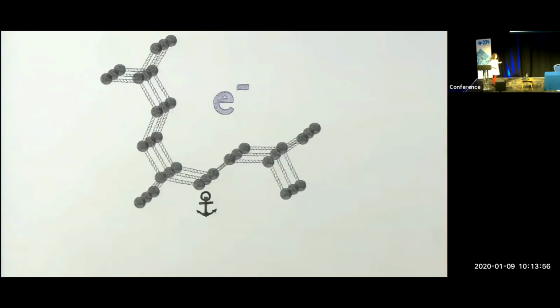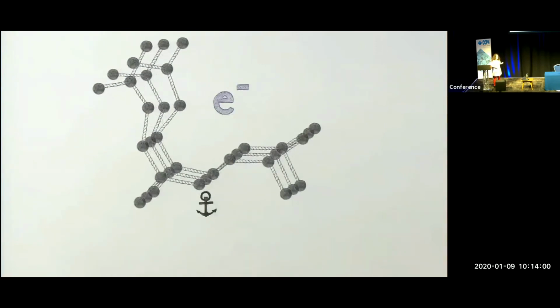And we're also able to introduce intramolecular motion along the backbone and also along the side chains in order to further account for the variation in the electron density between our observed electron density and our model.